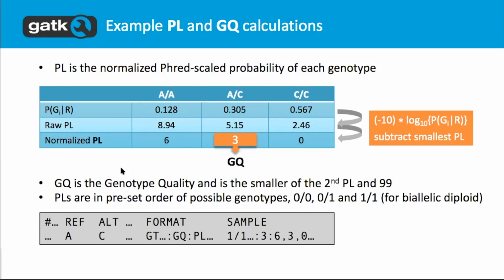These values are things that will come up. They're in the VCF. Those are the values that tell you whether you can trust the variant call or not. That's why I insist a little bit on walking through how they're derived. Because ultimately, whenever you have a variant call that's not super obvious, and you wonder whether this is really the right thing, those are the values you should look at to try to understand what happened and whether you can trust that in your downstream analysis, or whether you should be more skeptical that it represents the biological reality of your sample.